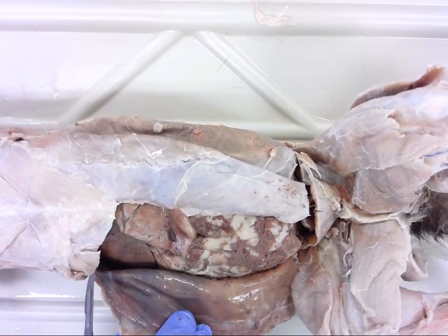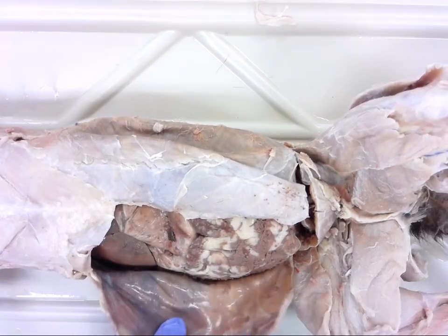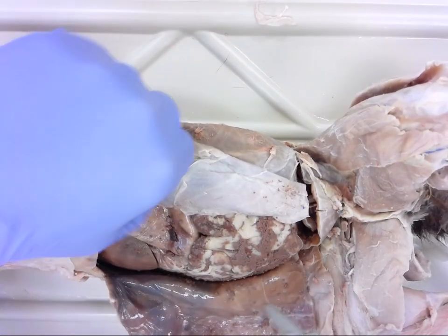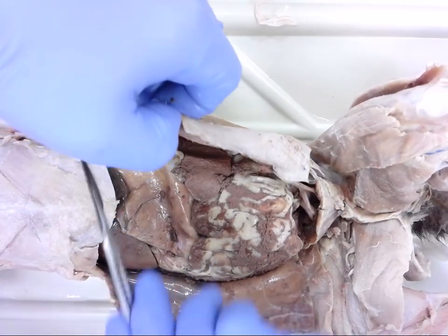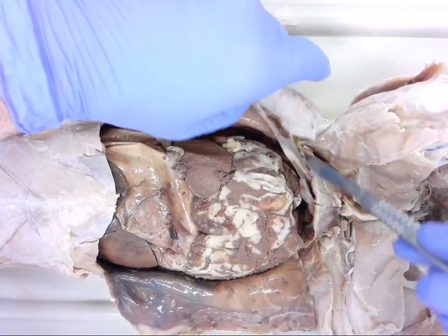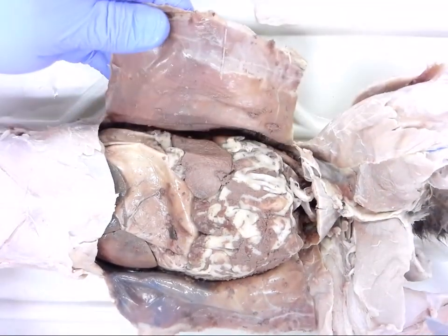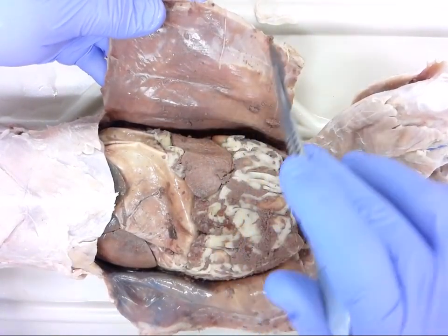All right, you could probably go up a little bit higher, but I like to keep the diaphragm intact for later discussion and dissection. Okay. I'm going to go ahead and cut along the other side as well. And from here you can see obviously our abdominal contents. And you can also see in this view the transverse abdominis. It actually runs right across, straight across.